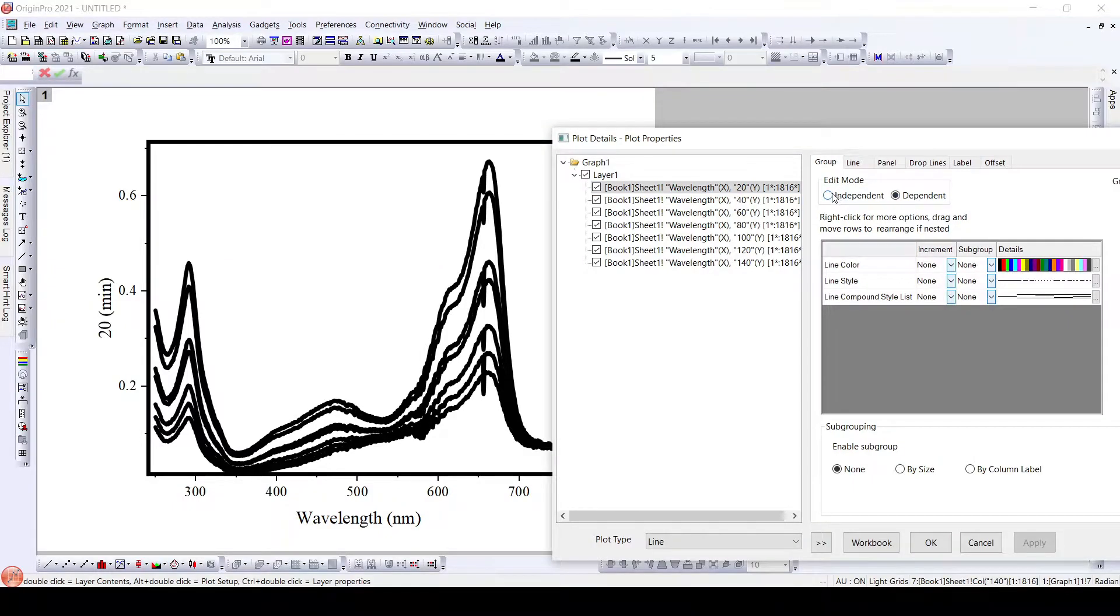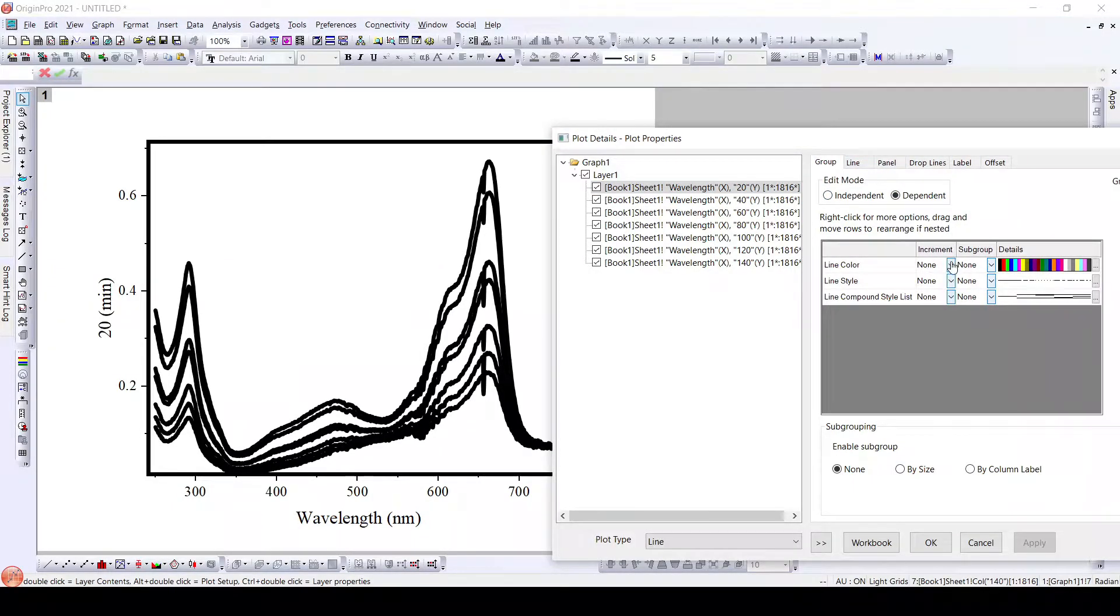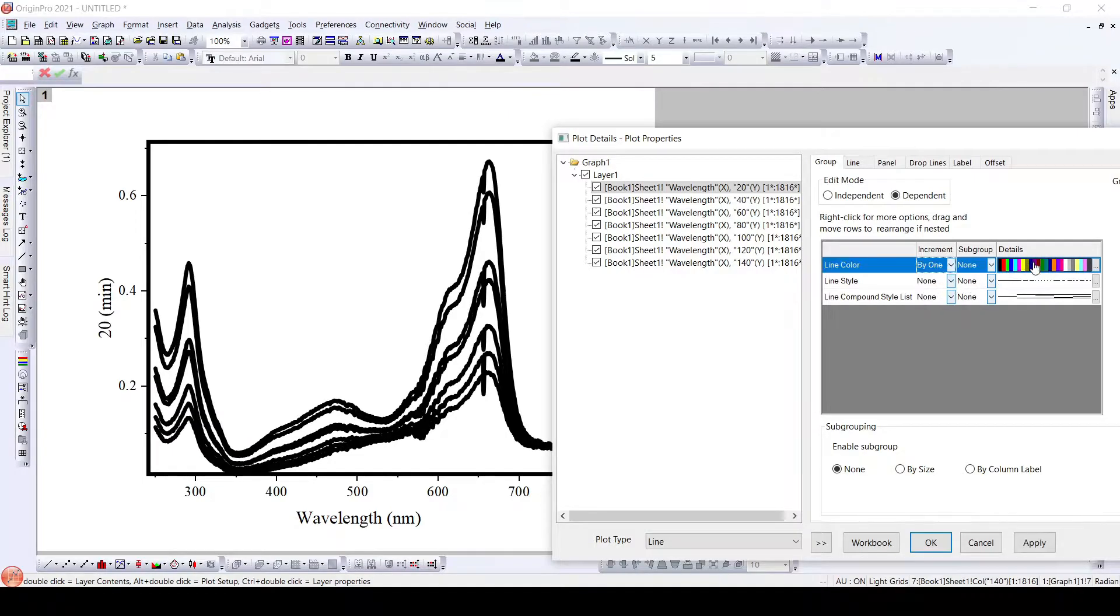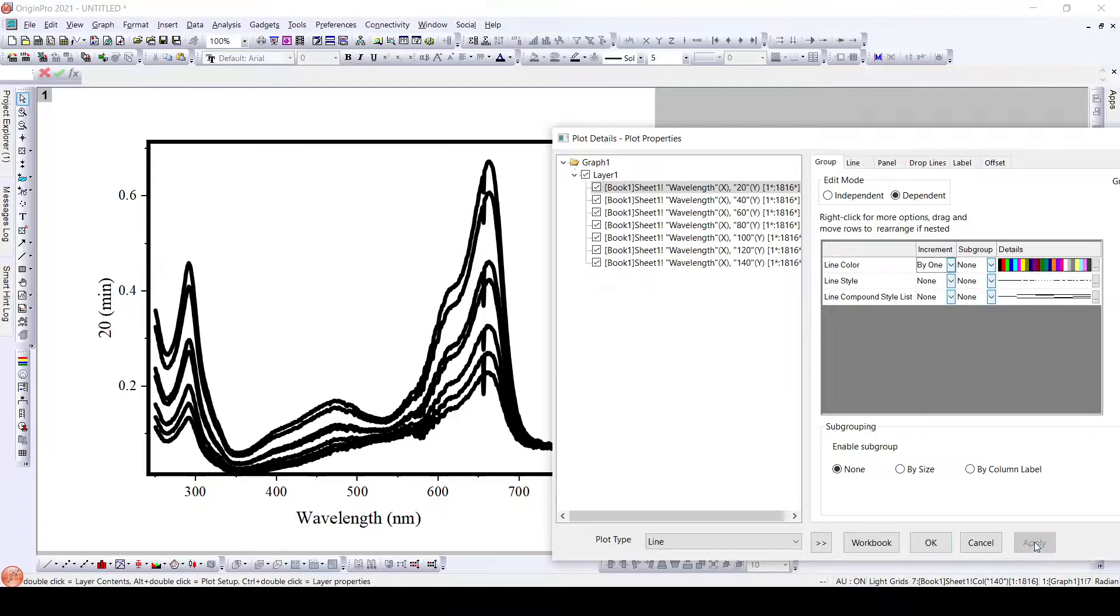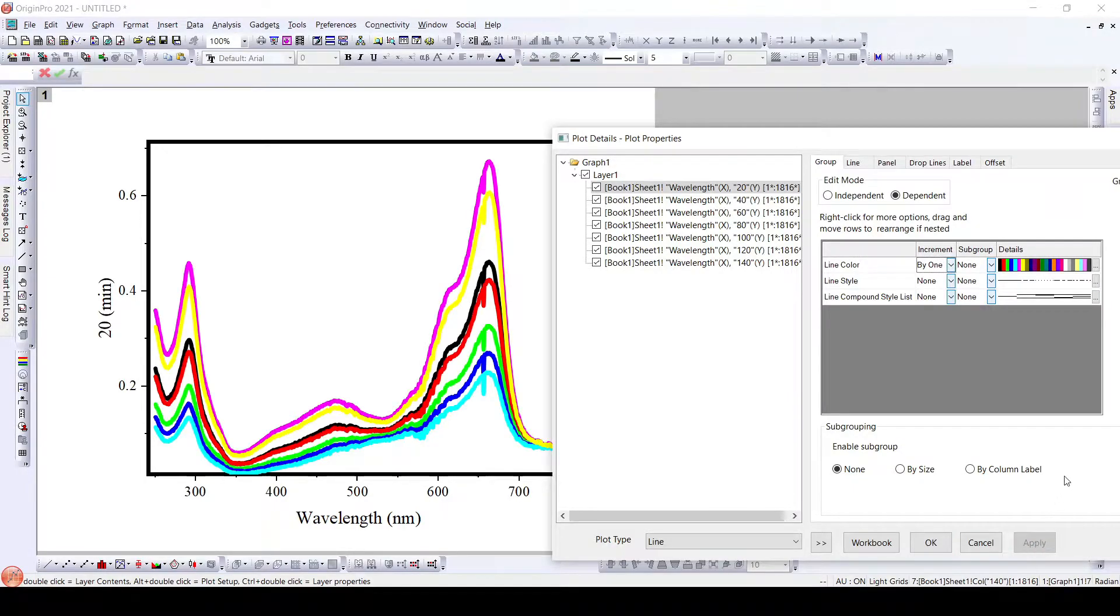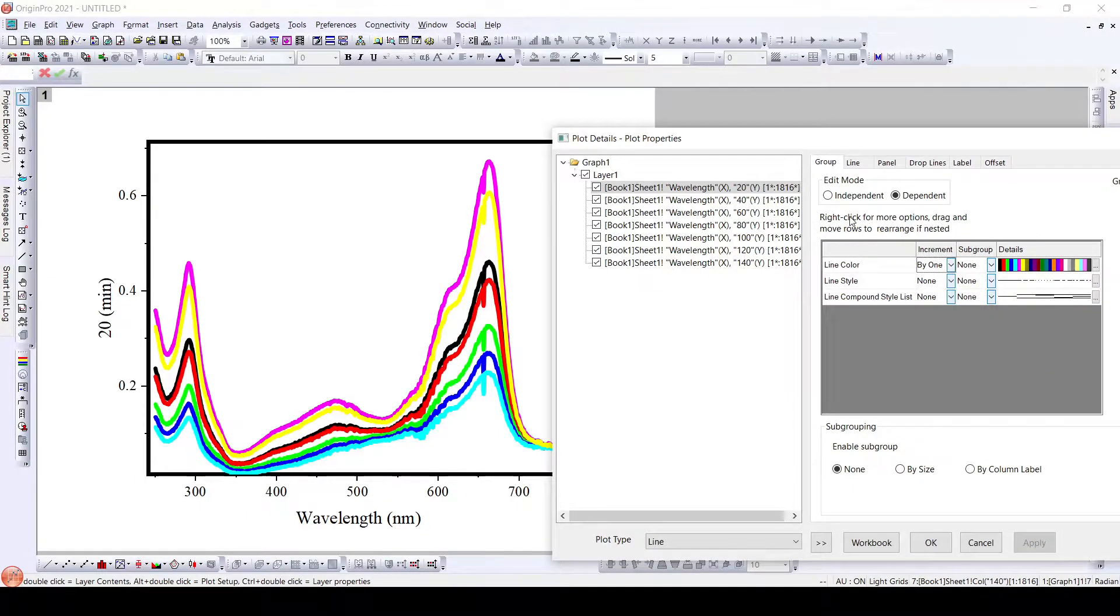When it is grouped, what you need to do is you just need to change the line color by one, and what you have is a set of colors that is already available. Just click apply and you get here when they are grouped.